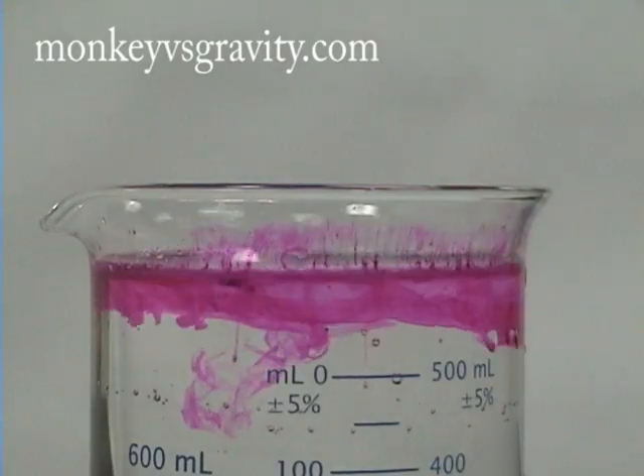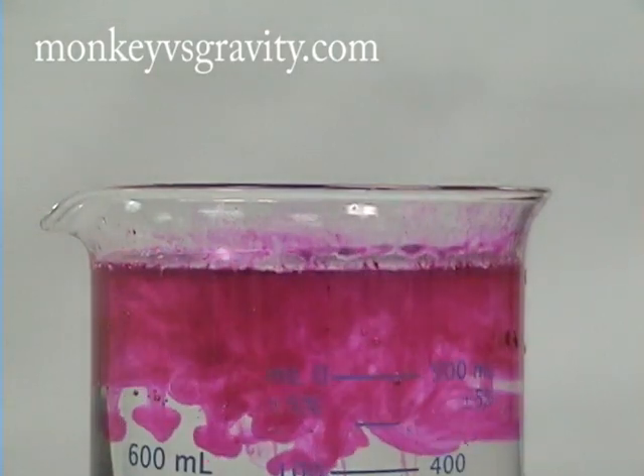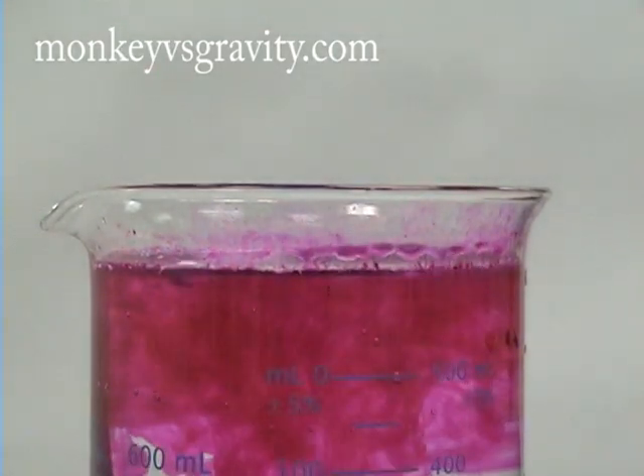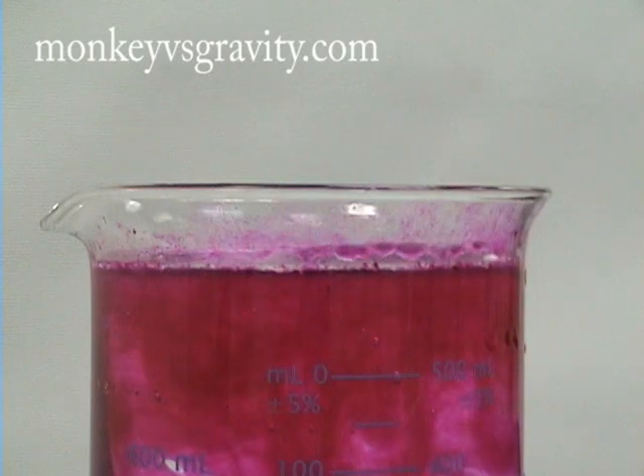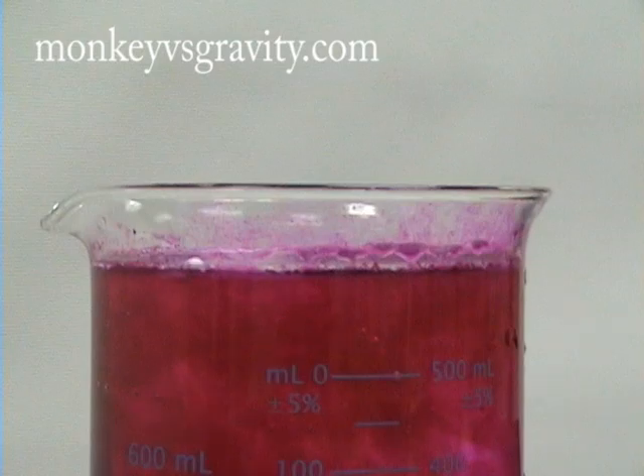When placed in water, sodium reacts to form sodium hydroxide and hydrogen gas. In this example, phenolphthalein, a pH indicator, has been added to the water, and the change in pH causes the phenolphthalein to become bright pink.